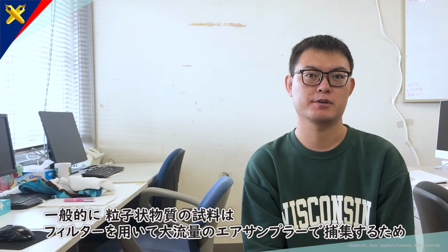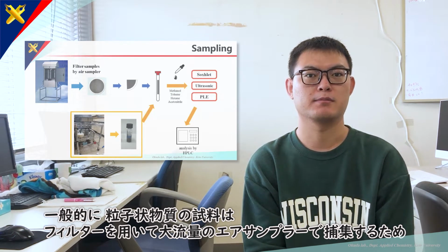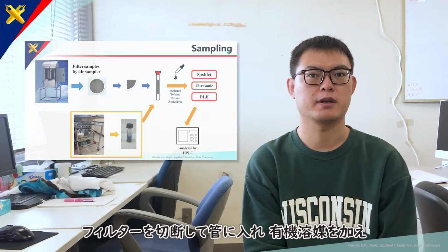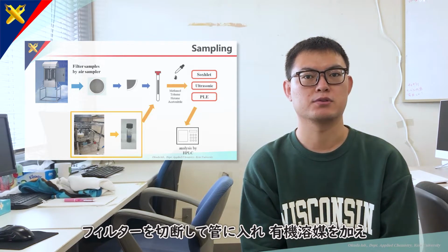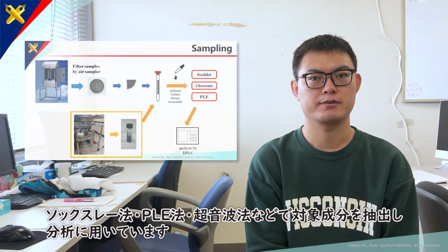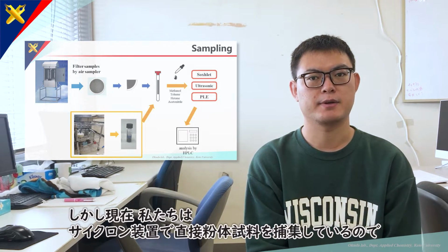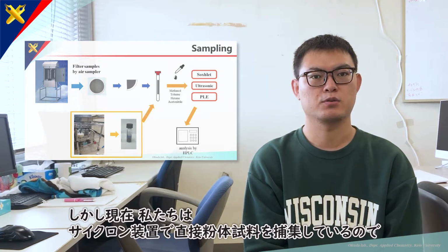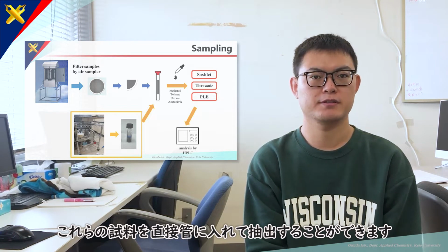In general, the PAH or the particle samples are collected by a filter with high volume air samplers, and we cut the filters into pieces into tubes, and use organic solvent and the ultrasonic or PLE extracting method to extract the pollutants for analysis. But now we use the cyclone to collect powder samples directly, so we can put the samples into tubes and extract directly.